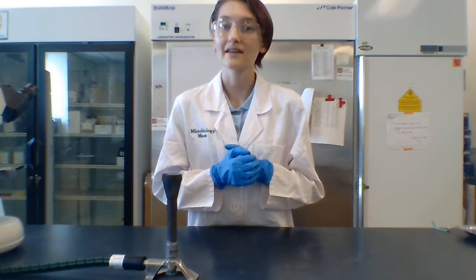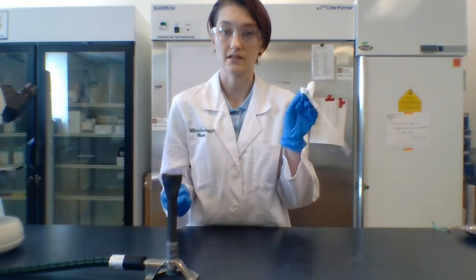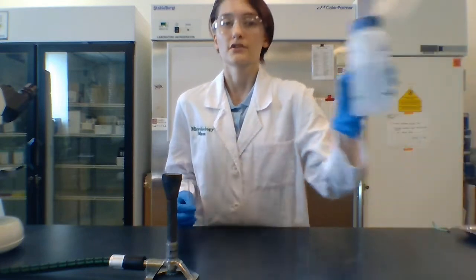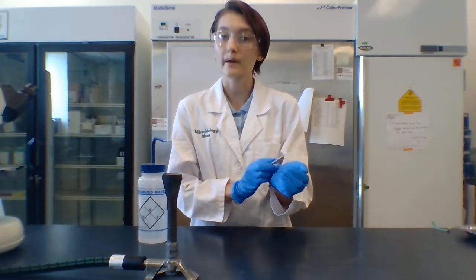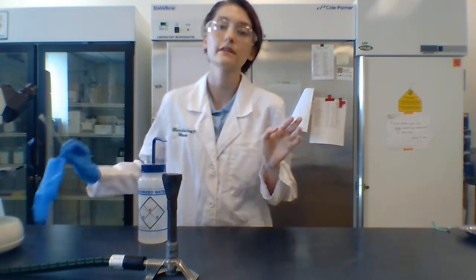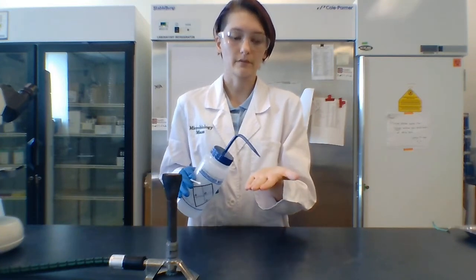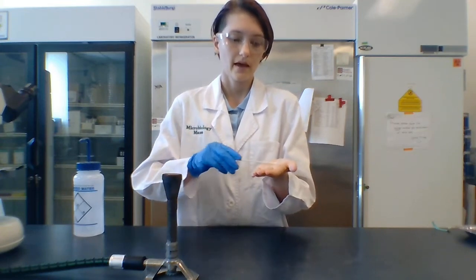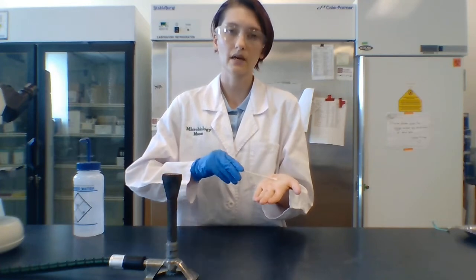So, taking a culture. What we're going to do to take a culture is we're going to use a sterile cotton swab and water. So water, sterile cotton swab. Let's say I want to sample the palm of my hand. I've washed my hands already, so the only germs we're going to find are the germs that live on me all the time. So what we're going to do here is drop a little bit of water onto my palm, which is going to make the germs nice and loose, and we're going to rub that with the cotton swab, and that's going to pick up the germs.